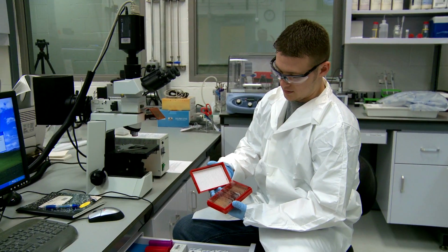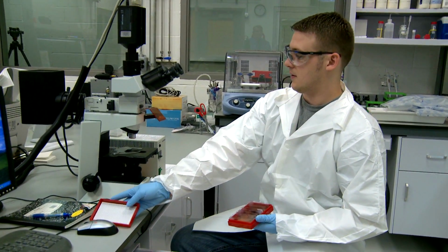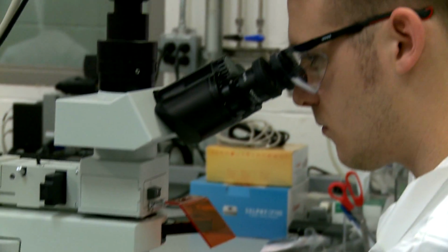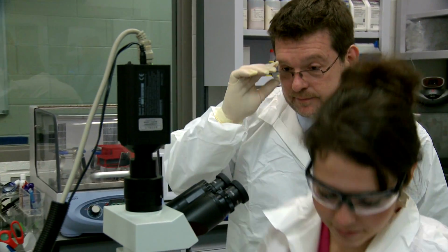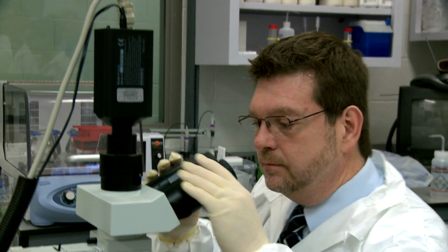But the most important thing for me is that we have now been validated that our facility and our curricular materials and our instructors are good enough. So it's an opportunity that we envision over the next 3 or 4 years expanding so that Kent State students could pick up either a certificate in biosafety or maybe even a minor in biocontainment and biosafety. So in other words, building a program that not only helps the National Institutes of Health, but then services the Kent State students as well.